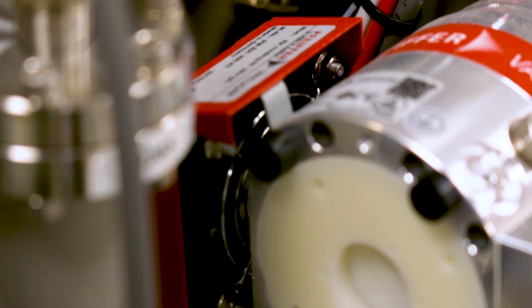It is very important for us to understand how our materials behave in certain environments to maintain flight safety, and understanding the level of detail that the SIMS and the microscopic analysis gives us over and above what we can do internally within our own laboratories gives us a lot greater understanding of what we can do to mitigate any negative effects. It's a really wonderful example of taking a technology from one context and applying it in a completely unrelated context. In this project, we're talking about taking something from the semiconductor industry and applying it in the aerospace industry. Rolls-Royce have been very active really from the beginning of this project and supporting it all the way through, and I think that's been really beneficial to everybody involved.